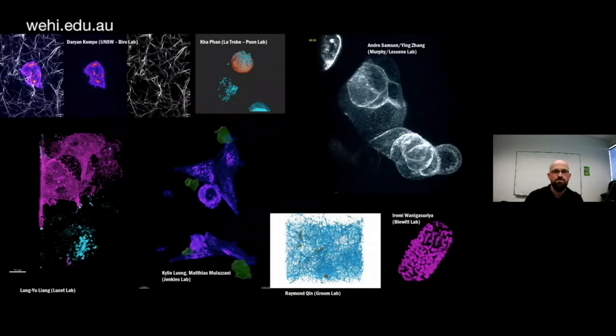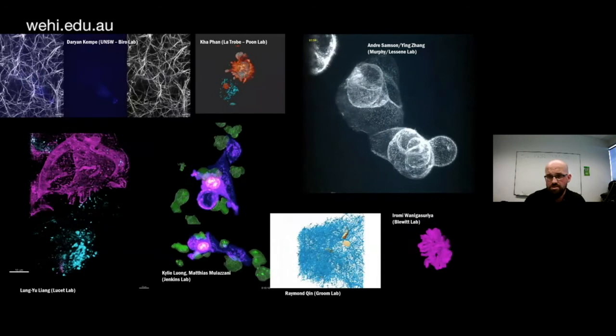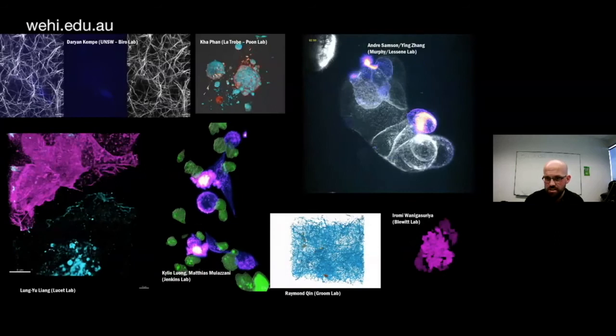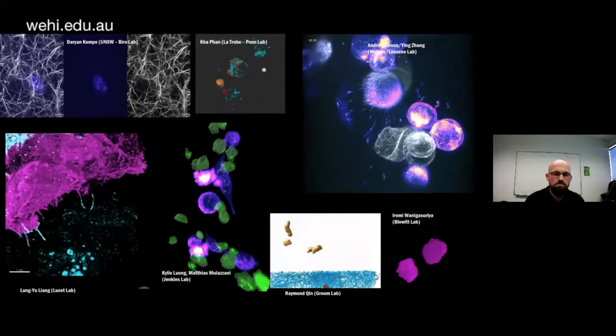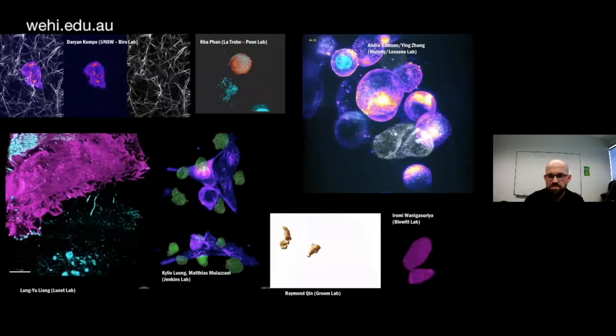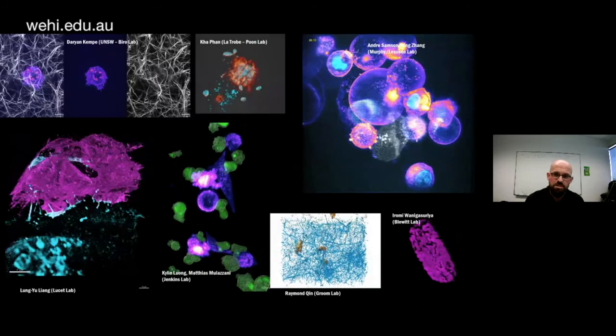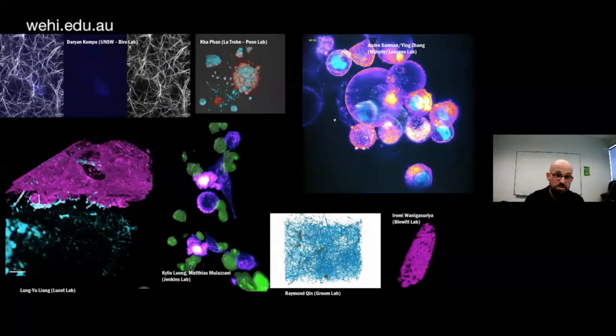But just to finish up here, this is to try and mirror that slide where Eric Betzig got up and spoke about all these incredible applications where they'd taken it to various groups. And here at WEHI, we're so well placed to do that as well. And we are doing that, across various fields from cell migration to cell death, cell-cell interactions, cell division, immune cell, target cell interactions. It really is the best place to try and situate these technologies. And we're in a really lucky position where we can do that.